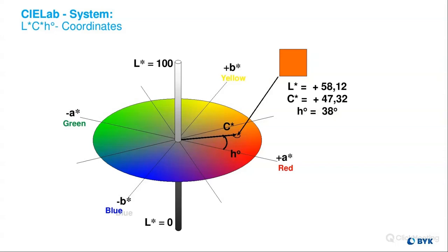So you can essentially pick an equation. Say you start with delta E star, and you measure a sample, and then you measure a standard, and you'll get that tolerance, and it'll tell you if you passed or failed and give you that delta E value. And it's a setting that you can change in the instrument, just which equation you're using.